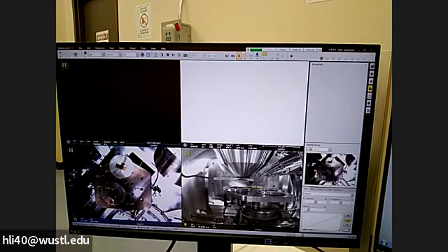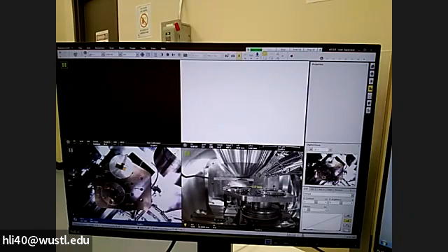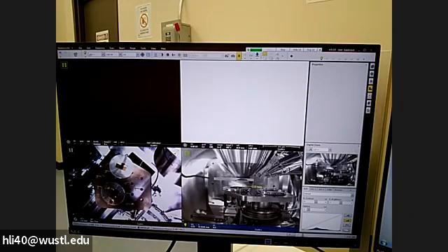Sometimes you come here and you see the image is huge. It's just because the digital zoom is on, so we go back to 1. If you select the window, you will digital zoom it. So don't be scared if you see something very different, like the image becoming very big or not the same as you last saw. Come here to check whether you are using a digital zoom.